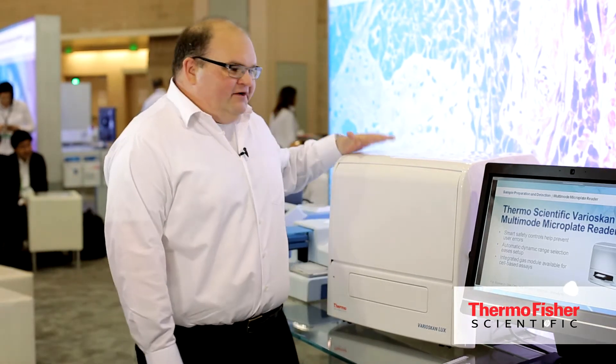Here we have the new Thermo Scientific Variscan Lux multi-mode microplate reader. It's a modular, upgradeable multi-mode reader for bioscience research use.